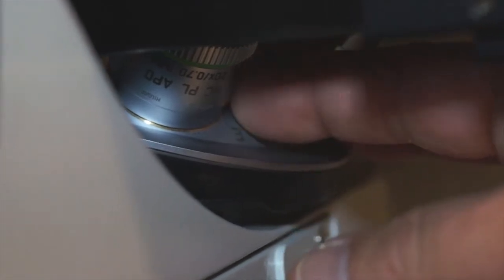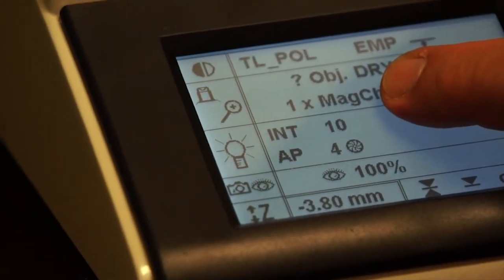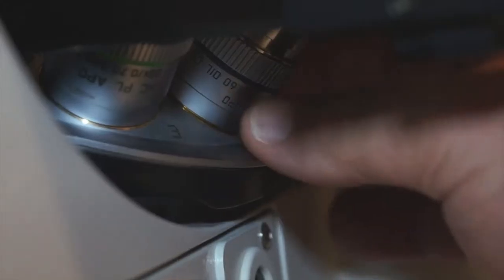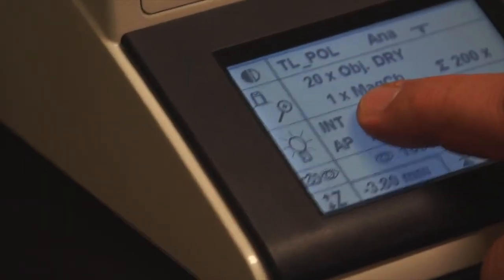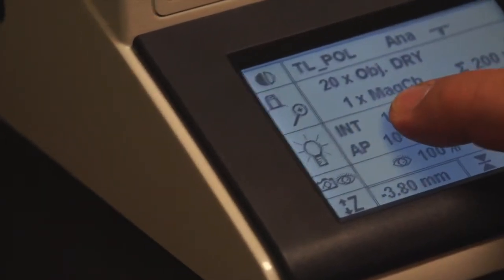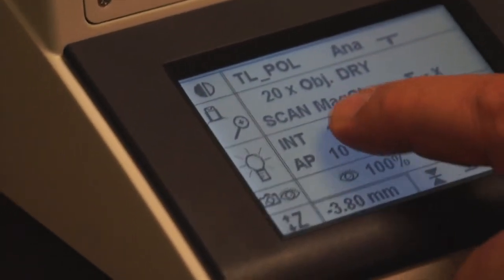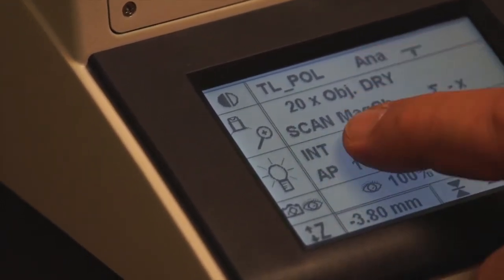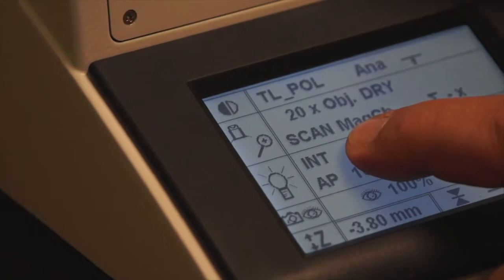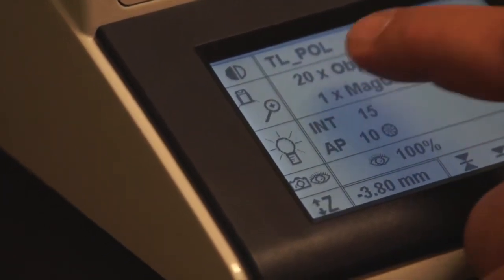When I rotate a particular objective into view, I can see on the screen the objective that the microscope is detecting. For example, now it's the 10x objective; if I rotate again, it shows the 20x objective. The screen also shows you if the 1x magnification changer is in place or if it's set to scan mode. When it's set to scan mode and you come back to visual observation, you must actuate the 1x magnification changer so that you can see the image in the field of view.